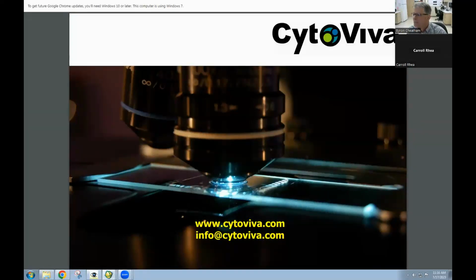All right. Okay, next. Number one, could there be any interference with heavy organelles like mitochondria, or maybe with organelles that natively contain metal particles like ferritin?